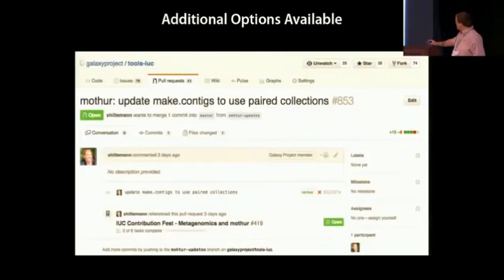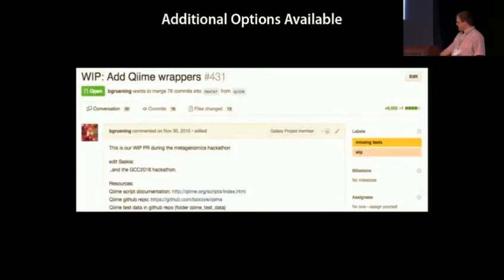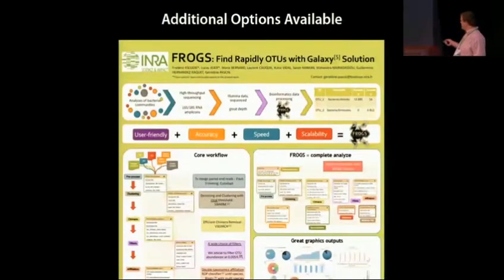We have a whole lot of other additional options for doing metagenomics now. We have a mothur tool set that has now been greatly updated. We're generating QIIME wrappers. You're going to hear about FROGS just shortly.